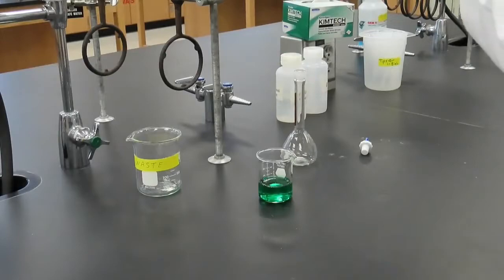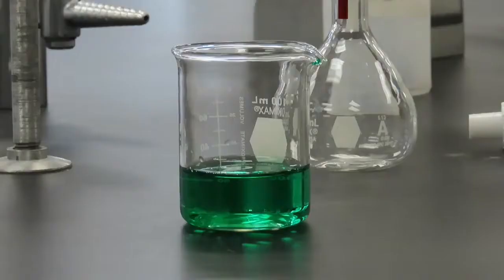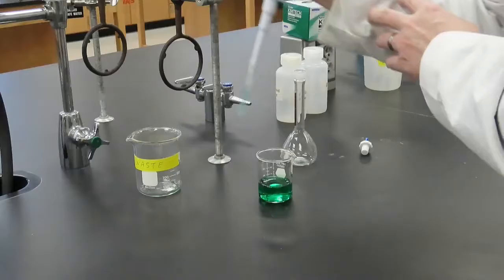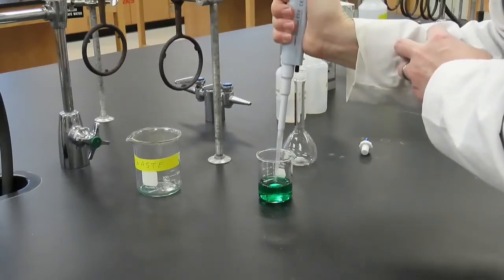Now we are ready to pipette. Hold the pipette vertically above your liquid. Press the plunger to the first stop and place the end of the tip just below the surface of the liquid.